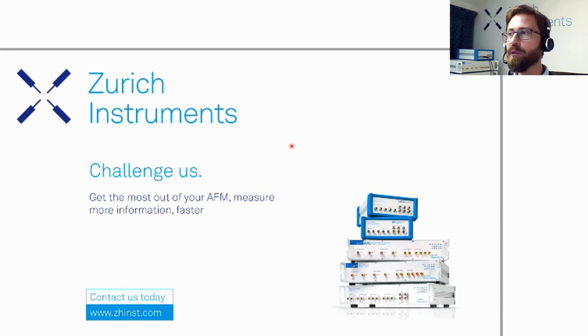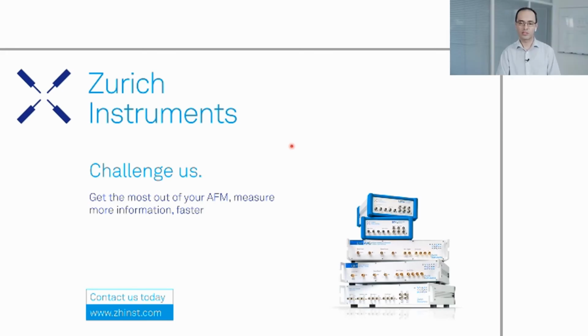So let me switch now to a question for Mehdi. What is the actual ultimate time resolution you can achieve with this pump probe method, at least on the AWG? Yeah, that's a very good question. The minimum time depends on the minimum width of the pulse that we can generate, and with the current AWG, we can easily achieve a few nanoseconds. Okay, just a few nanoseconds.